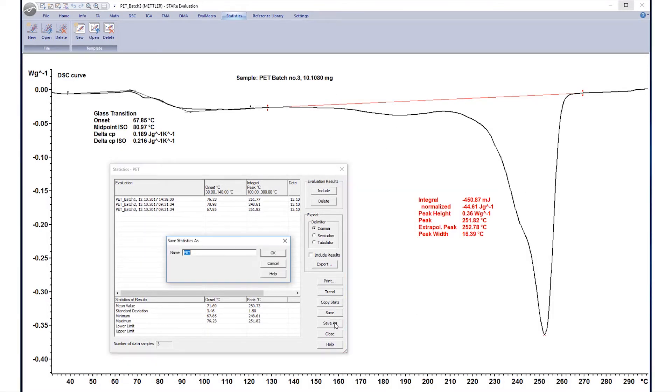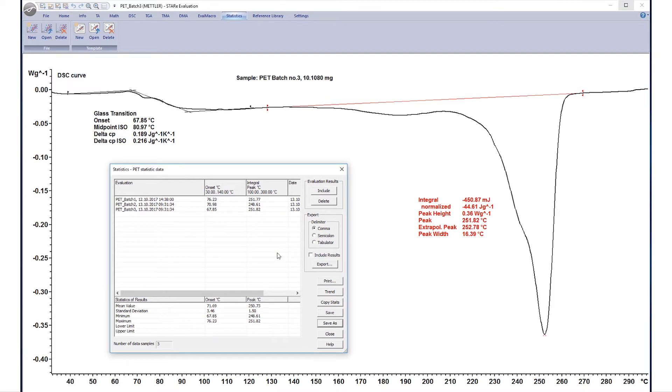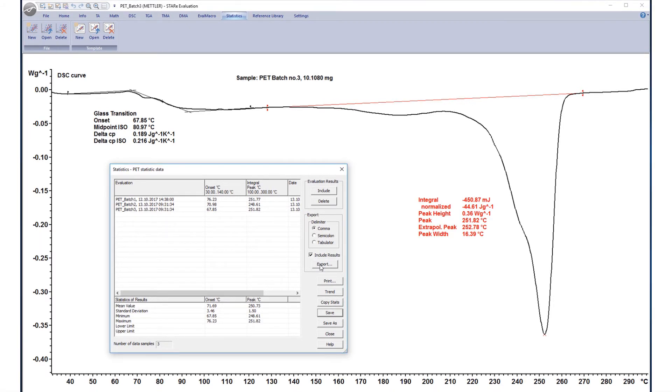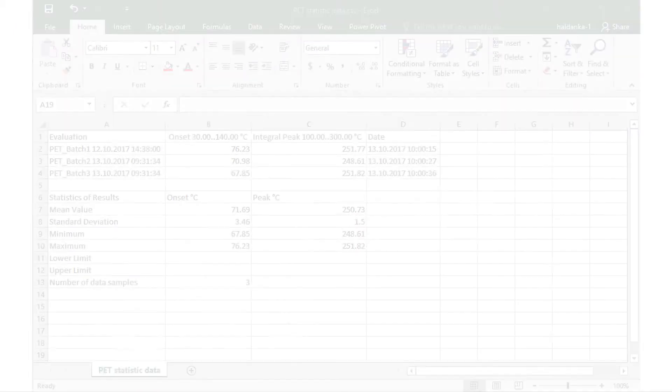To save the statistics, click Save As, enter your preferred name, and click OK. You can even export a statistics evaluation in CSV Excel format, character separated values. Check the Include Results box to include statistics in the export file.